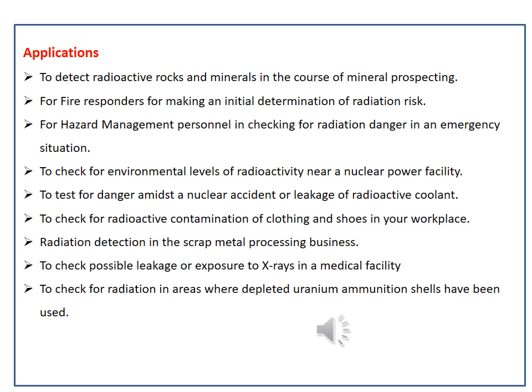to test for danger amidst a nuclear accident or leakage of radioactive coolant, to check for radioactive contamination of clothing and shoes in the workplace, radiation detection in the scrap metal processing business, to check possible leakage or exposure to X-rays in a medical facility, and to check for radiation in areas where depleted uranium ammunition shells have been used.